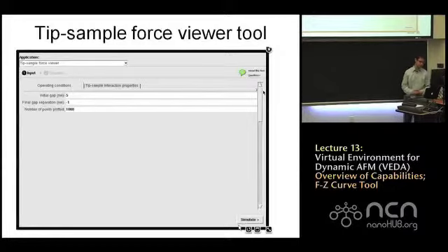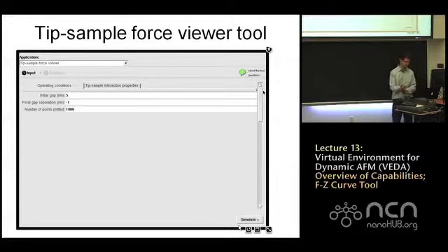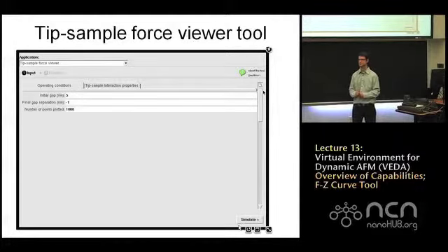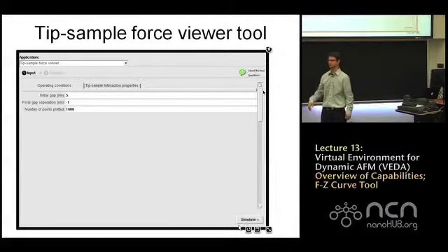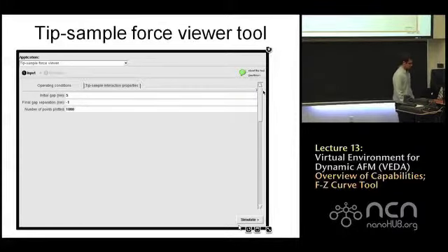Okay, so let's select the tip sample force viewer tool from that drop-down menu on the previous page. Okay. Hold on. Let's check to see if everybody got there. All right. Everybody got there? Anybody not got there? Do we need to get up and look at everybody's screens? Or can you raise your hands if you don't get there? Please? So at any point in time, if you guys are behind, just raise your hand and I'll pause. Because if you get left behind, for some reason, you won't catch up.